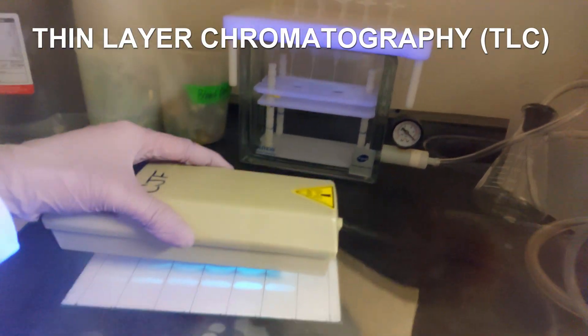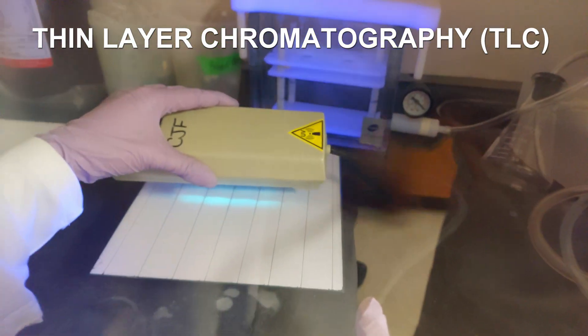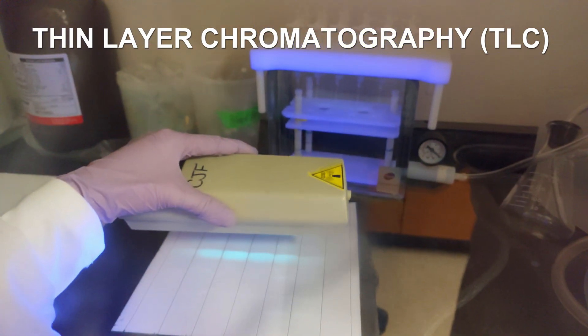The first band here is phospholipid, and if you go up a little bit, this broad band is your triglyceride.